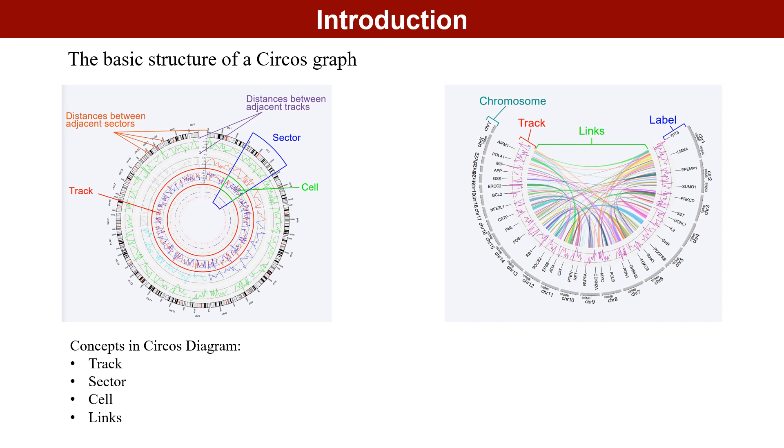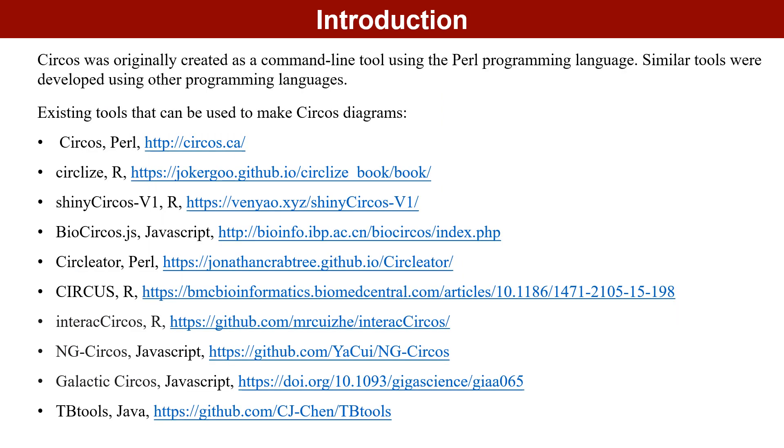Within each sector, genomic data can be represented as cells, which are rectangles representing a single region.